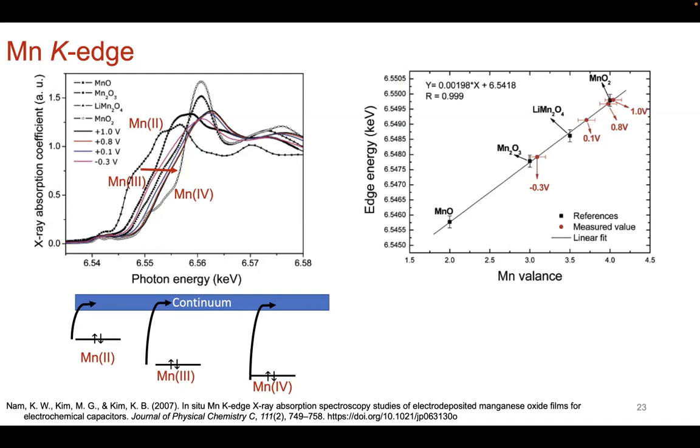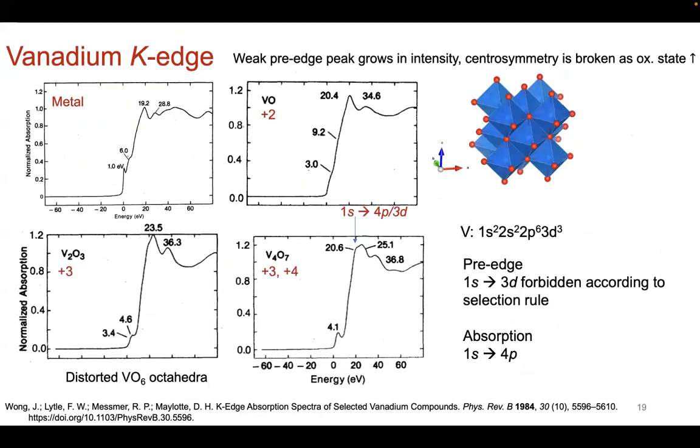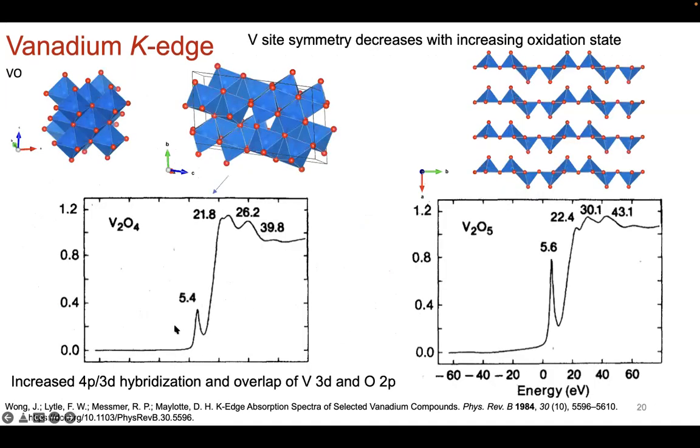Yeah. Oh, and if you really wanted to know, but you didn't ask, the emergence of these two pre-edge peaks, not just one. So here you see the shoulder, then essentially two, based on first derivative, you can resolve two shoulders, and then one peak here, and then one here, and then I guess one here.